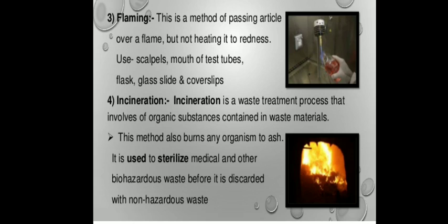To sterilize such materials or glasswares, the flaming technique is used.